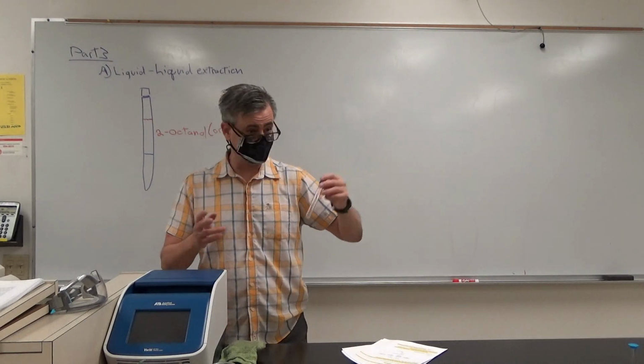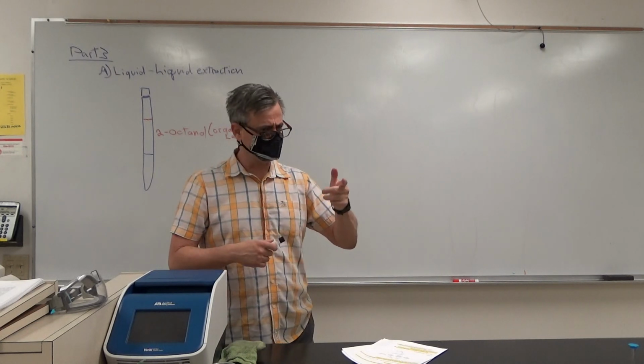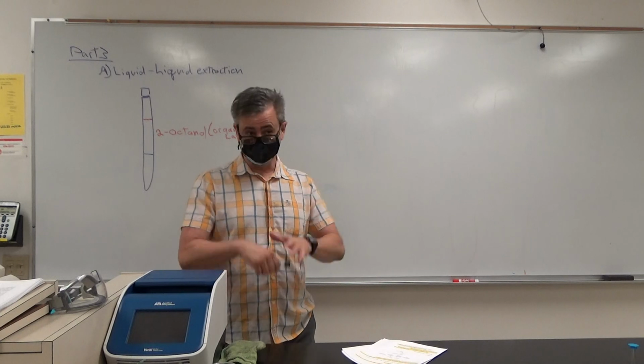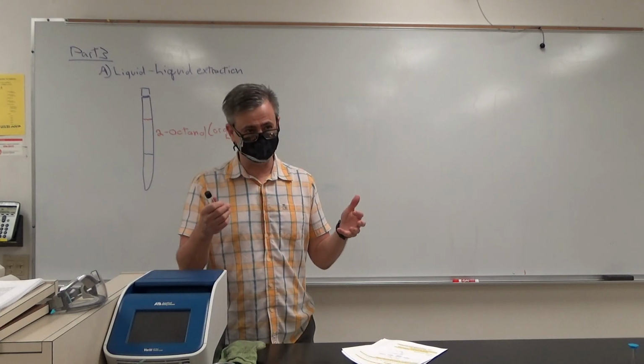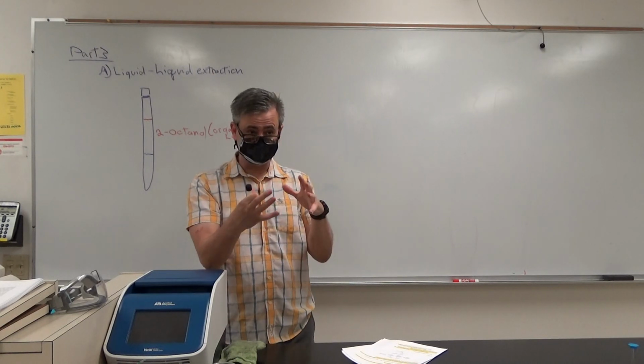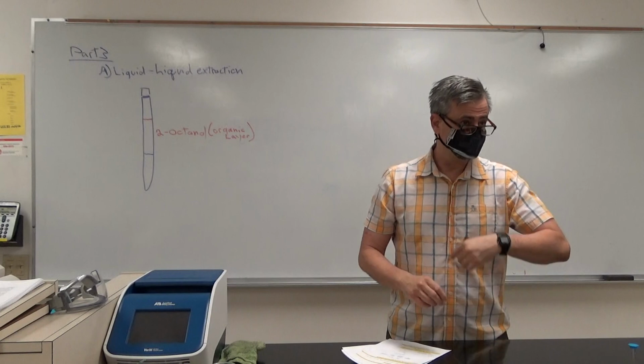Okay. You can put in 2 that are opposite each other. Okay. I think those ones will take up to 6. And you can put in 6. So if 6 of you are ready to go right at the same time, then you just got to make sure that it's balanced, that there's 3 opposite each other. All right. You'll centrifuge it.